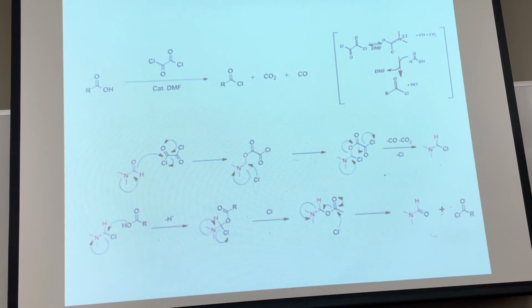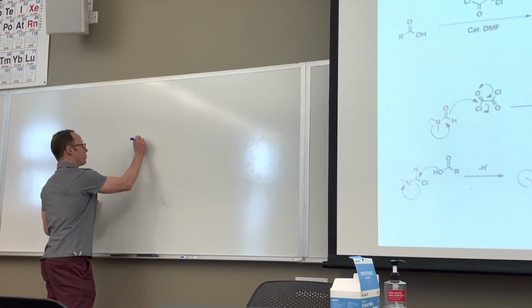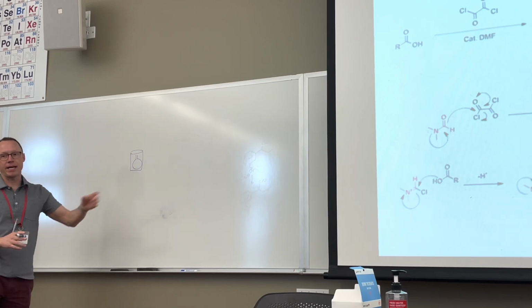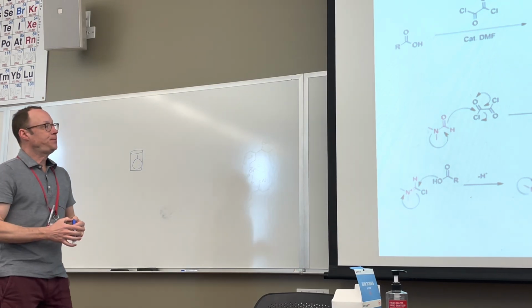What you're probably going to want to do, because the round bottom flask is going to have to sit and stir in the fume hood for about half an hour or so, I would probably just grab a beaker and you can set the round bottom flask in, and then set that on the stir plate, and that'll hold it in place as it reacts in the fume hood for half an hour. Okay.